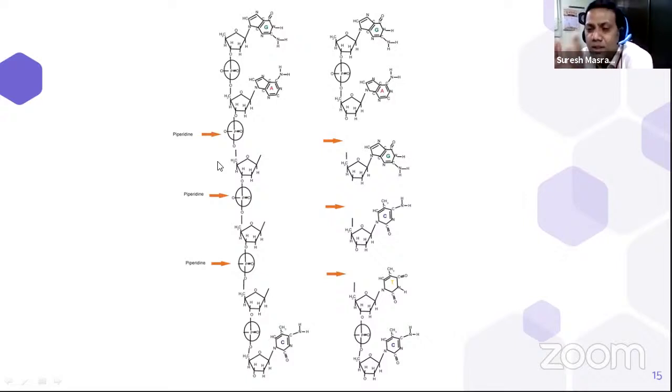The purpose of hydrazine, dimethyl sulfate and formic acid is to depurinate or depyrimidinate the single-stranded DNA. After that, piperidine acts at the location where there is no purine or pyrimidine, and at that same spot it cuts the phosphodiester bond and thus cuts the single-stranded DNA.